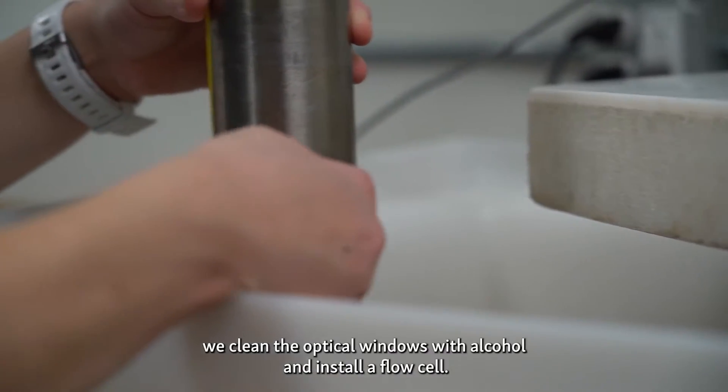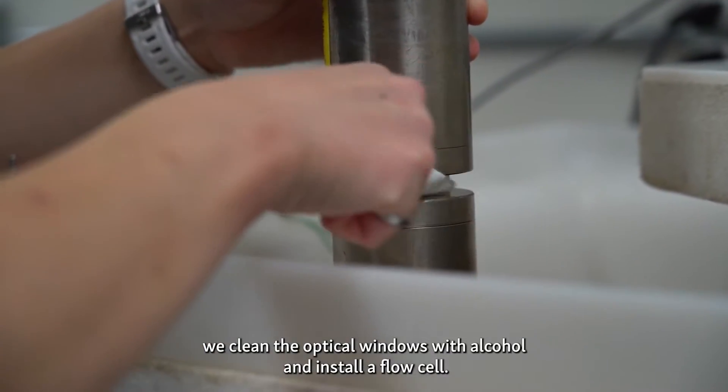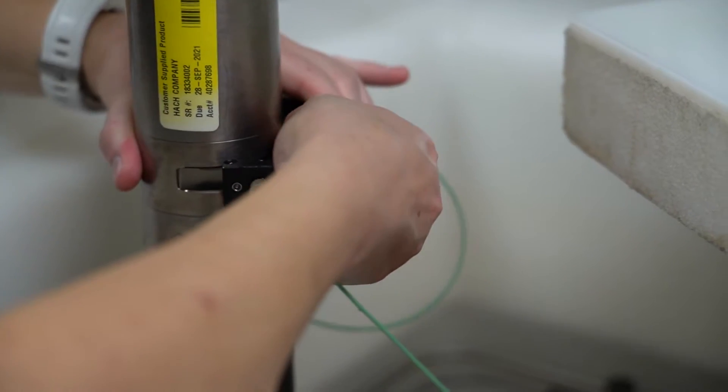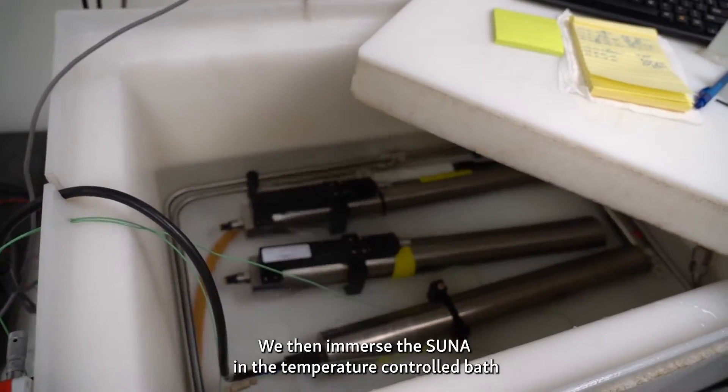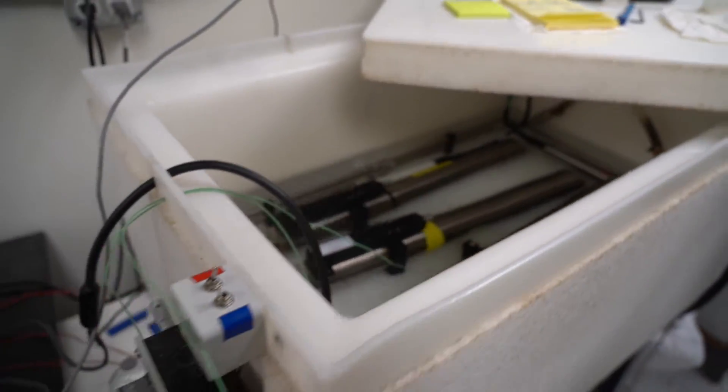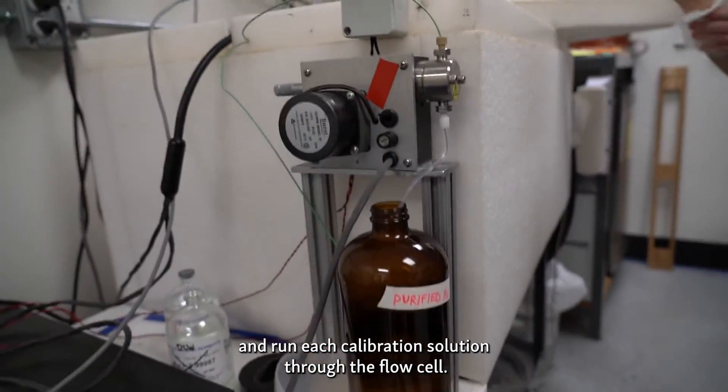At the beginning of the process, we clean the optical windows with alcohol and install a flow cell. We then immerse the SUNA in the temperature-controlled bath and run each calibration solution through the flow cell.